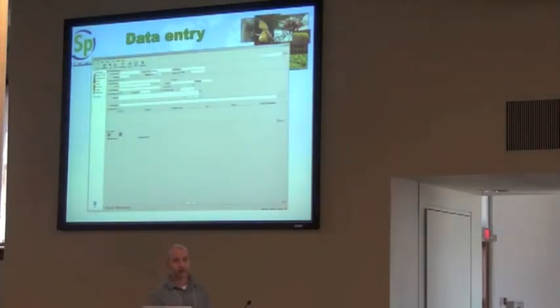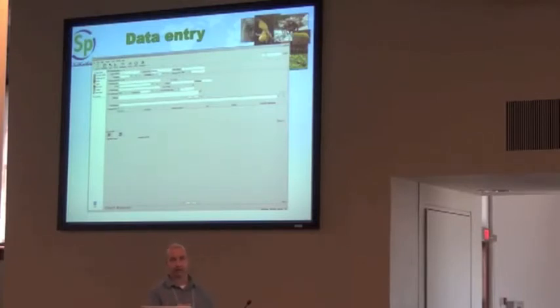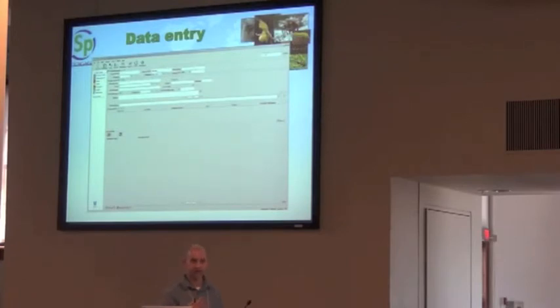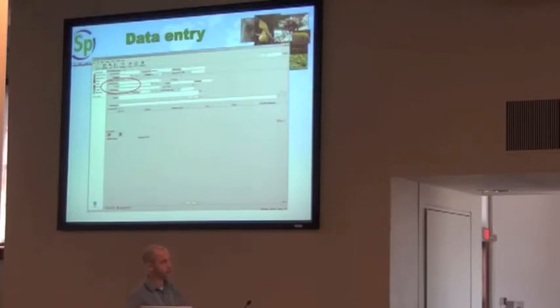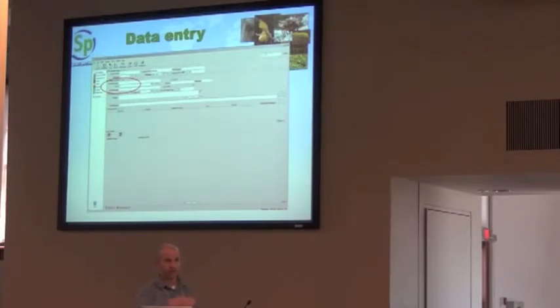This is your initial view of Specify — the opening screen with the data entry form open. You can manipulate all of these data entry forms: add or remove fields, move them around, resize them, recaption them, and change the way they're presented, so you can customize the entire experience specifically for your collection and your particular discipline. There are also pick lists and all those features built into the forms to facilitate data entry and keep your data clean.